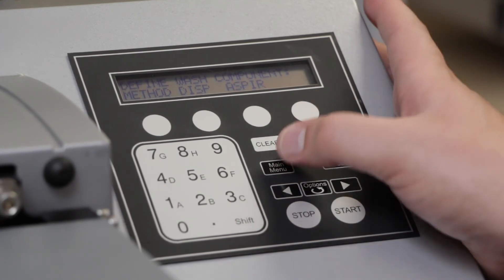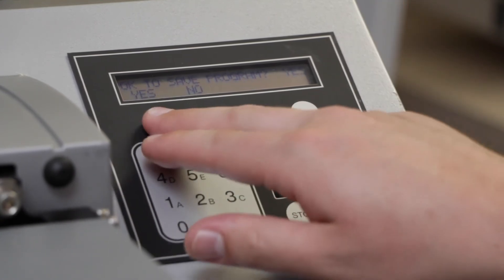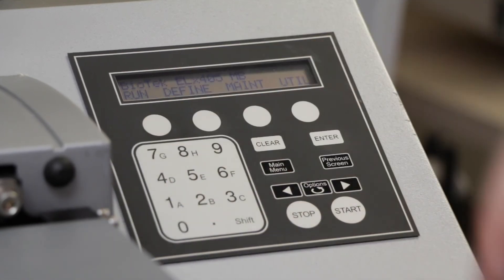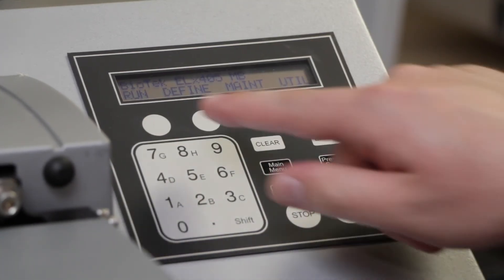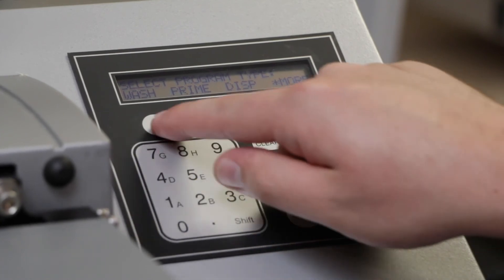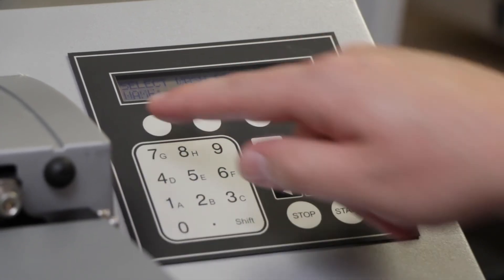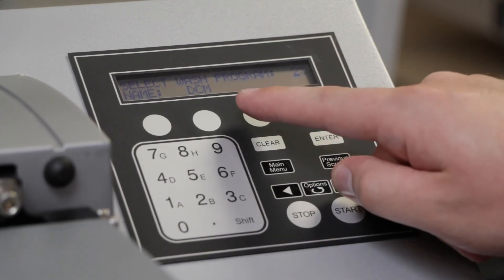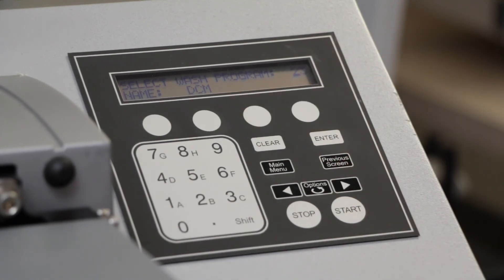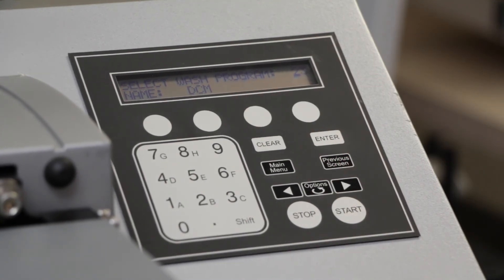Once you're finished, press the main menu button and press yes to save your protocol. To run your newly created protocol, select the run option. The wash, in our case, is the protocol type that we just created. And scroll through to find the name of the protocol. Once you hit start and answer a few quick prompt questions, you're ready to run.